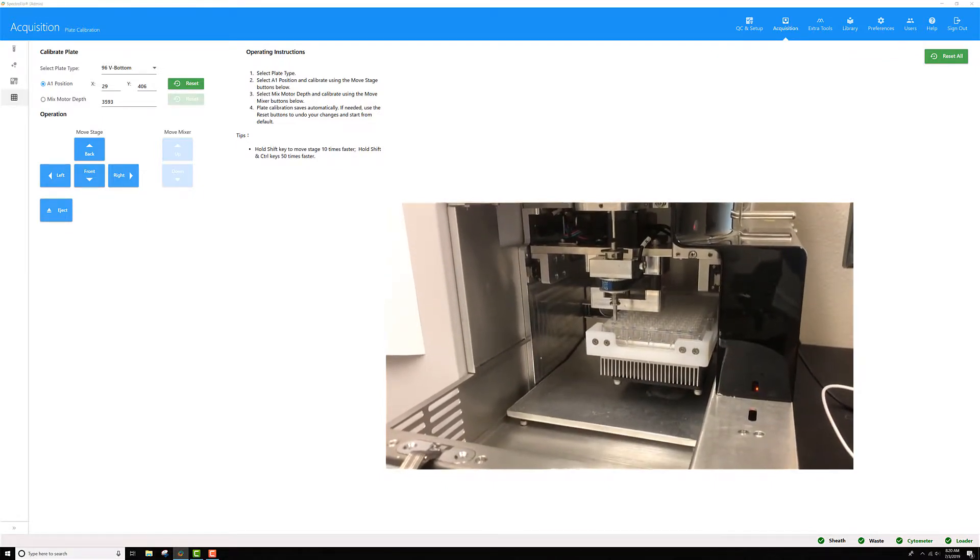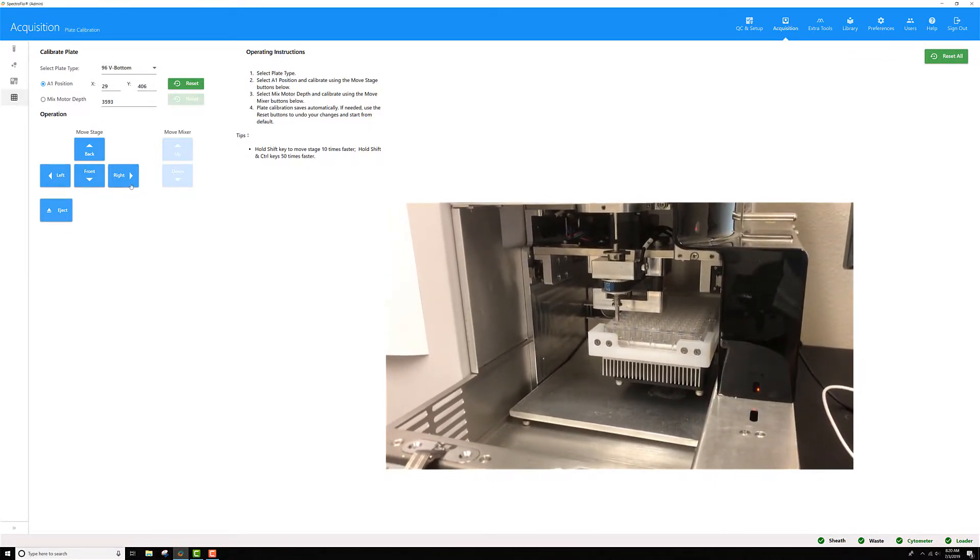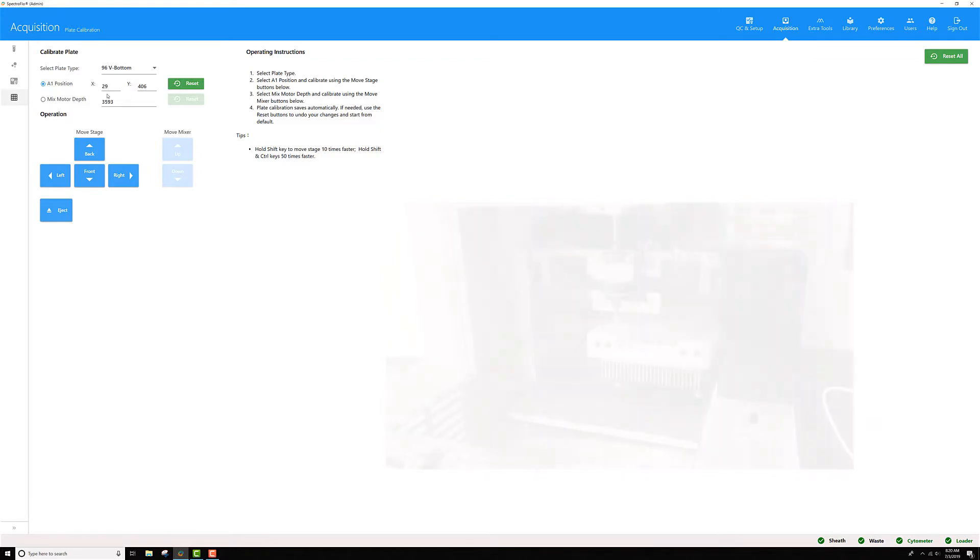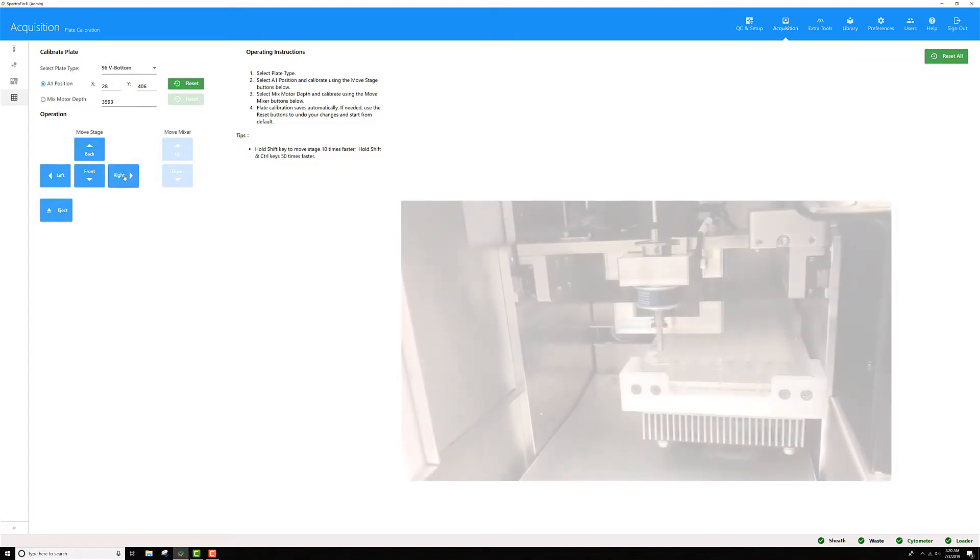Click cancel for this. Now that I'm over A1, you'll want to eyeball it from the front and adjust the left to right positioning. You can use these left and right arrow keys to move.